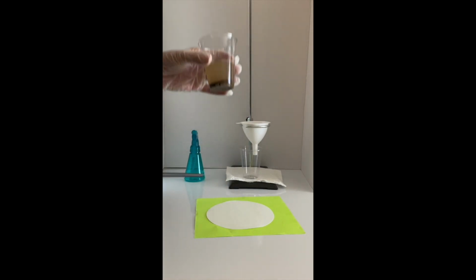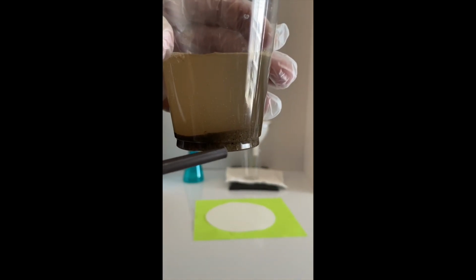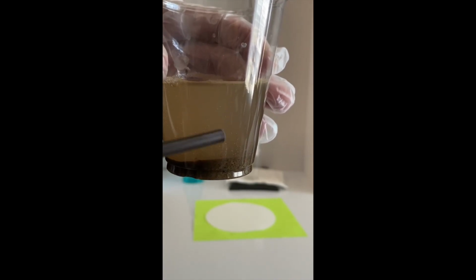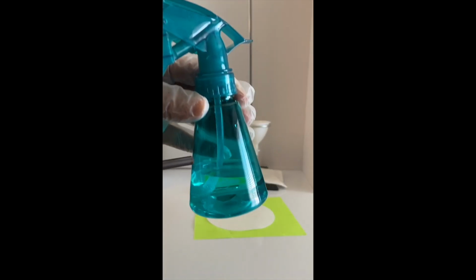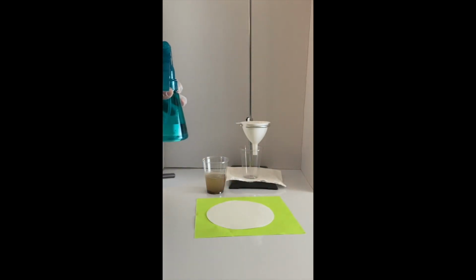Here we have a suspension of sand and water. Notice that the larger dirt particles have already settled to the bottom. Also, some tiny dirt particles remain suspended in the water, giving it a dirty or murky look. We also have a spray bottle with distilled water. We will state the purpose of the distilled water while demonstrating the filtration technique.